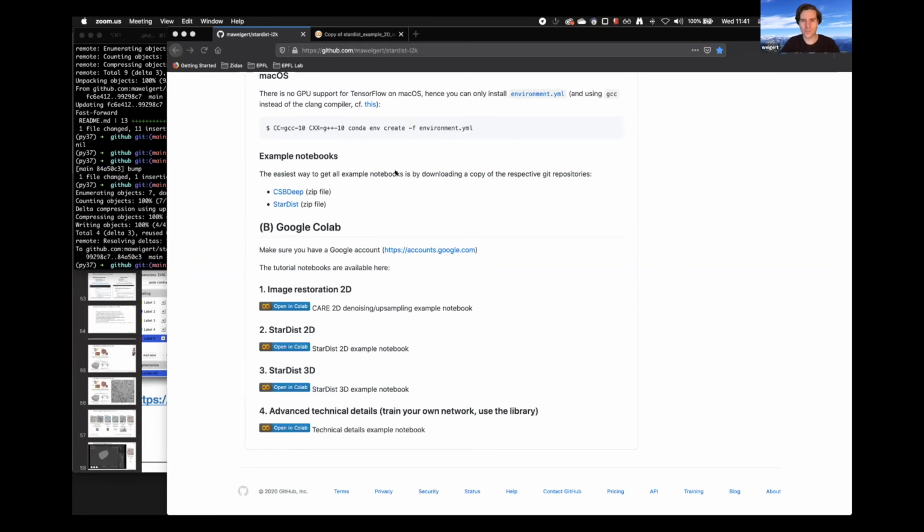It's called room 1. But Uwe is going to be in room 1 during the next half an hour or 40 minutes that we do the tutorial notebook in the main room. So if you already have some super specific use case, you know what to do, you want to do something that is not 3D StarDist or just want to be quicker with everything, just go into that room. Uwe will be there and can guide you through your problems that you might have, might be data annotation, all these kind of things that are not in line with just a regular 3D StarDist workflow. Just go into this room 1, and I would propose Uwe is just there and waits.